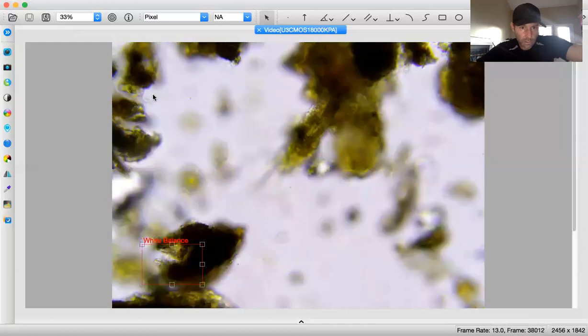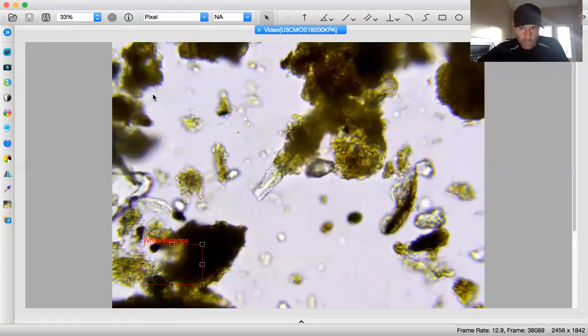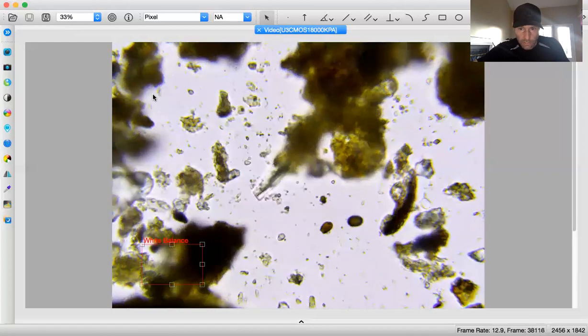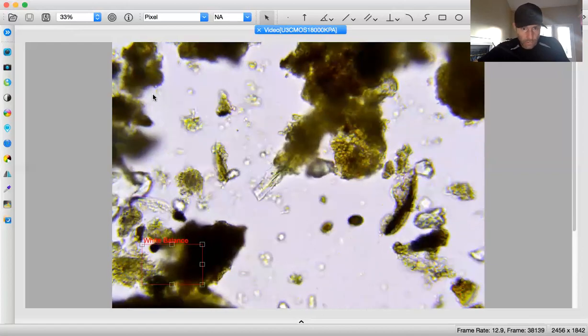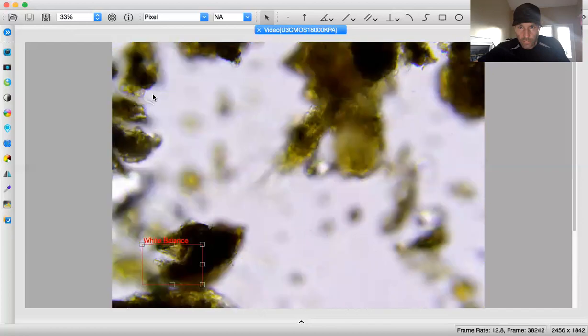So this particular area, I'm gonna say is a 0.05 for that actino. Let me just do a general actino assessment so I can accumulate them all into one number to fit into my box if there are more. And I'm not seeing more.